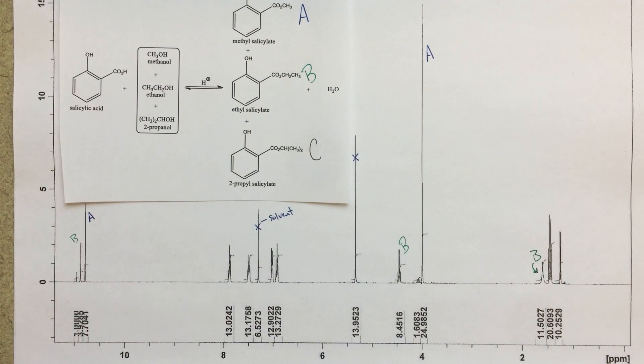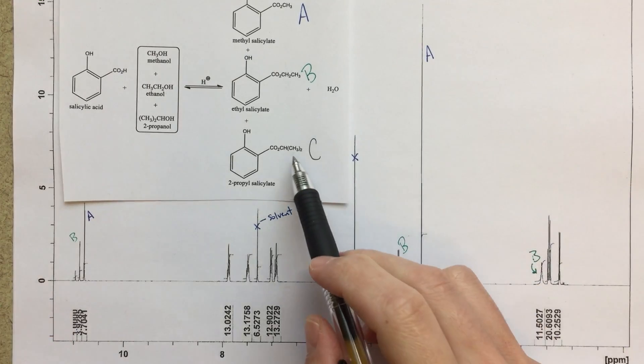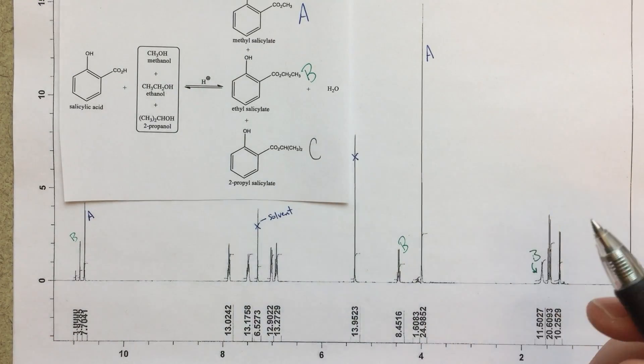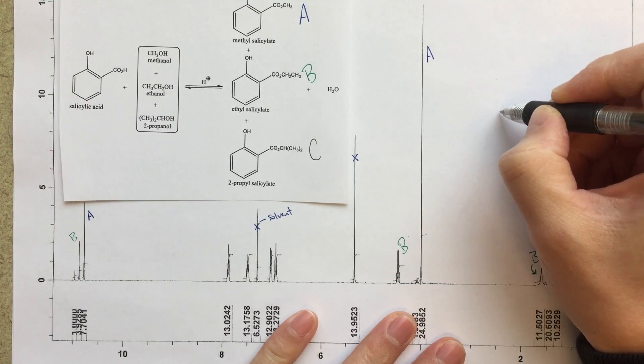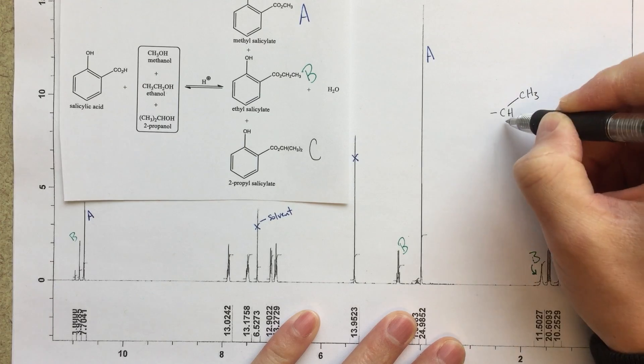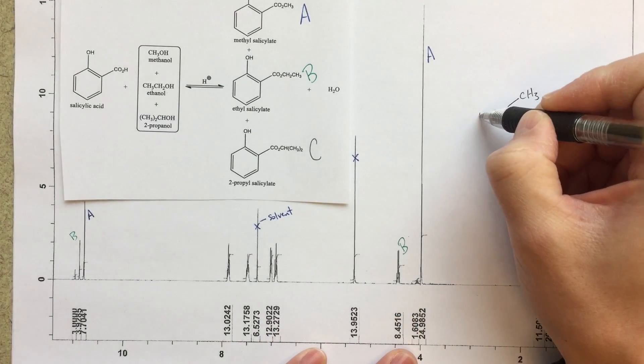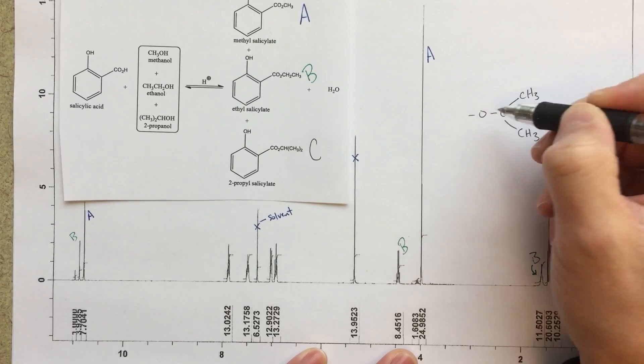So let's move on to C. So for C, I'm going to use this black pen, and for C, we've got an isopropyl group. So an isopropyl group, maybe we'll just draw a little picture here. So C is going to be like that. So then this is going to be our O, and then the rest of the molecule.